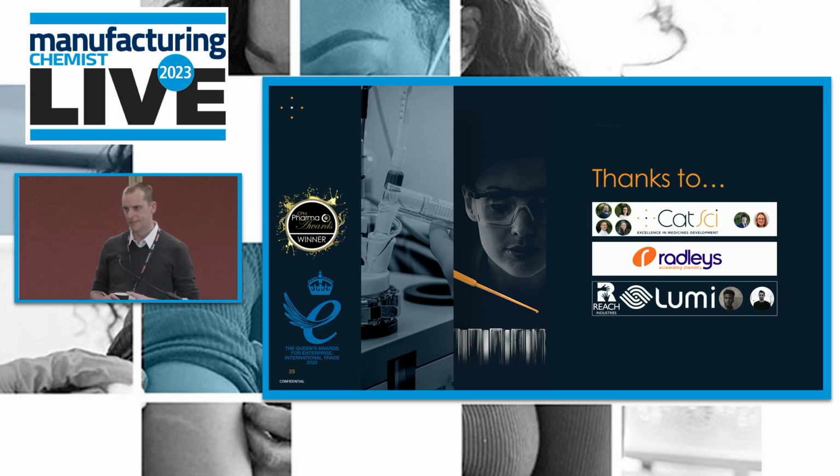Yeah, great question. We've done no comparison. I'd imagine, so I'm speaking without any data, so take what I say with a pinch of salt, but my experience of taking products which are developed outside of the laboratory and trying to apply them directly has challenges. They can do things, but they need a lot of development because they're just not built with the same data sets. I think with Benchling, you might have a competitor, and I've not looked at this product.